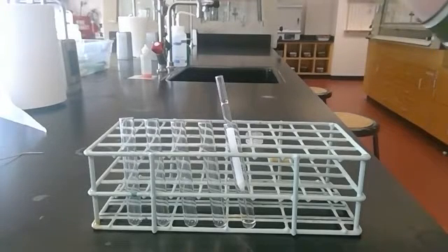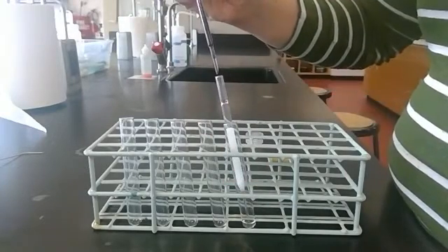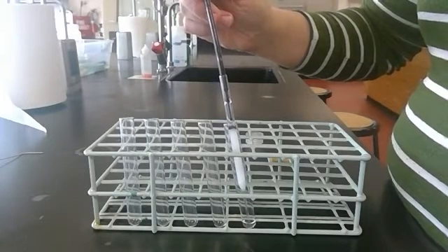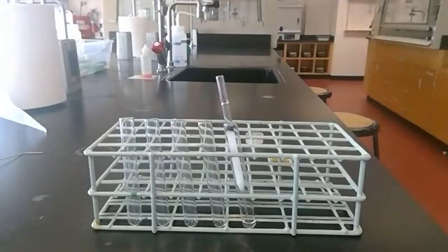And so I'm going to put this on the top of the silica gel. And I don't want to have a lot of volume because this is dissolved in water. All right, so I'm going to put 3 drops. And you can see that dark color, so concentrated, it just actually looks black right there.